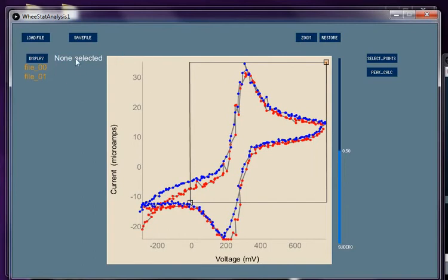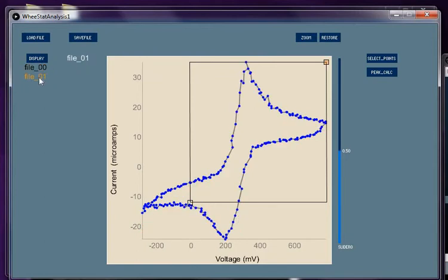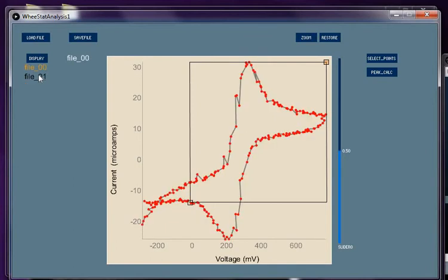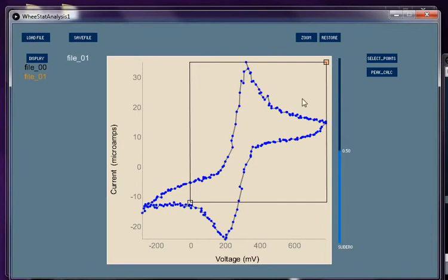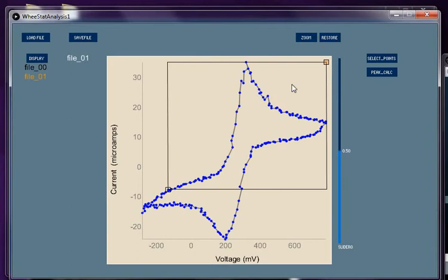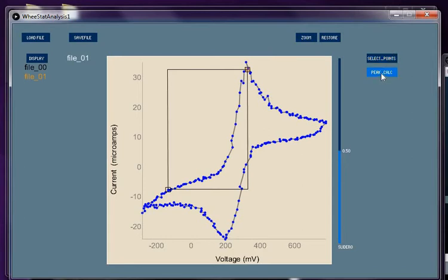It says over here that neither of the voltammograms are selected. Now I've just clicked on this file 01 and it says file 01 is selected. That's the first thing we need to do. We're going to figure out what the peak current is here and we're going to need to have two points defined. We're going to pick a point that's on the baseline on the positive scan. I'm going to pick the point with the orange box that is our peak position.